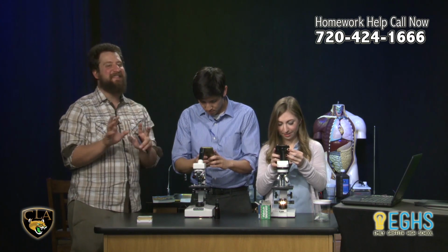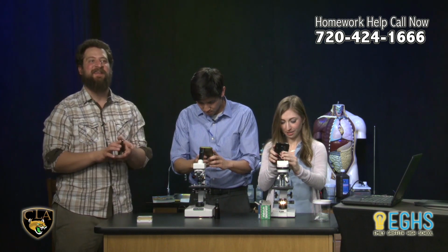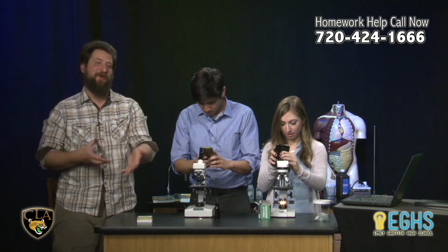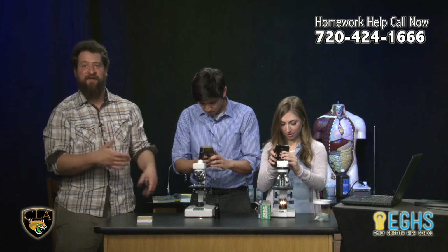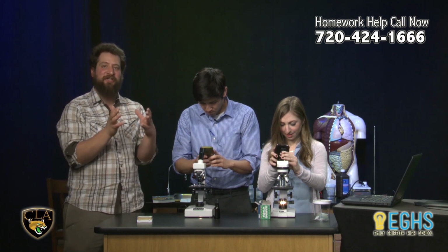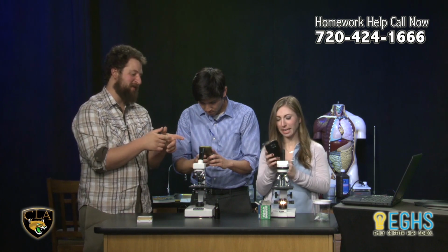Yeah. So this is another thing that I have gotten good at, because I have a bunch of students and I was helping all of them take pictures. So I practiced like 35 times. This is really tricky to do at first, but once you get a good shot, you can really see pretty well. This is sort of harder than taking a selfie.